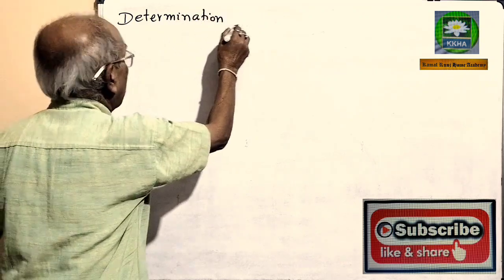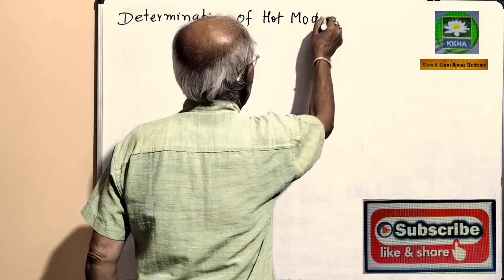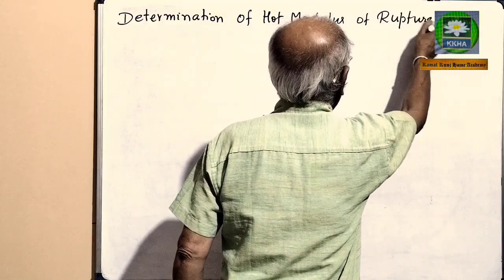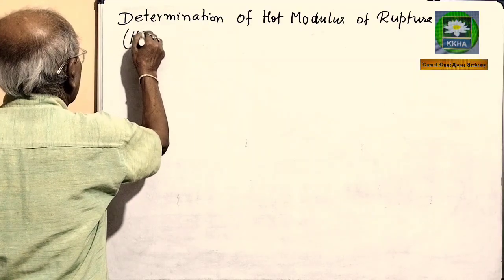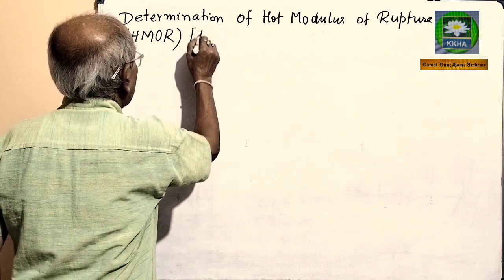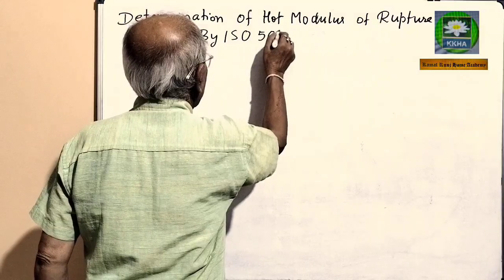Determination of hot modulus of rupture, HMOR, hot modulus of rupture, by ISO 5013.